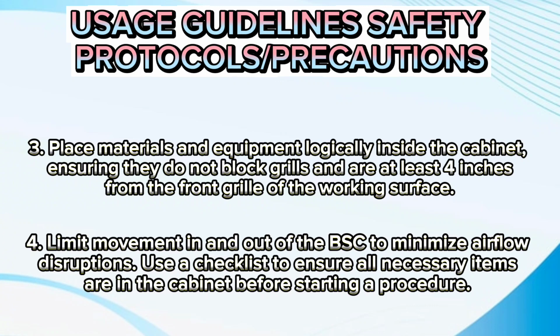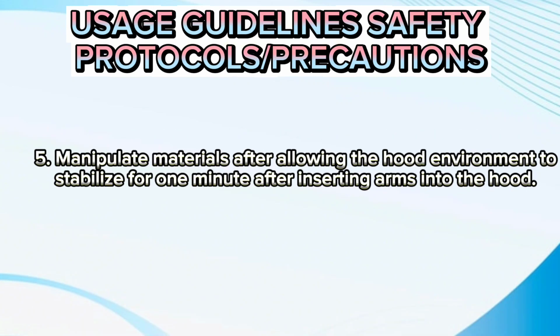Fourth, limit movement in and out of the BSCs to minimize airflow disruptions. Use a checklist to ensure all necessary items are in the cabinet before starting a procedure. Manipulate materials after allowing the hood environment to stabilize for 1 minute after inserting arms into the hood.